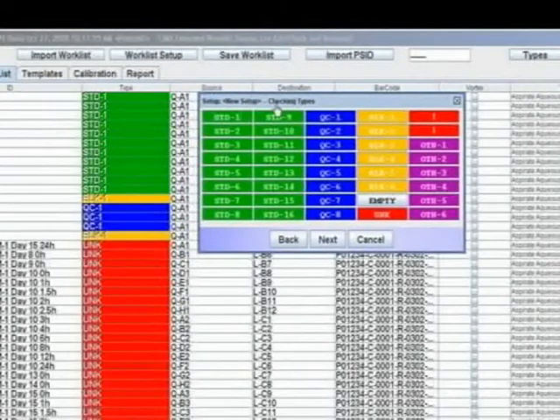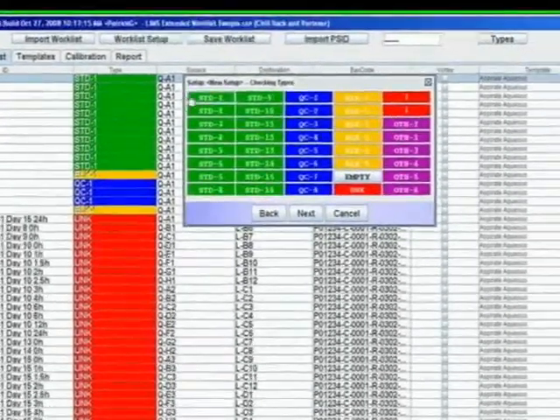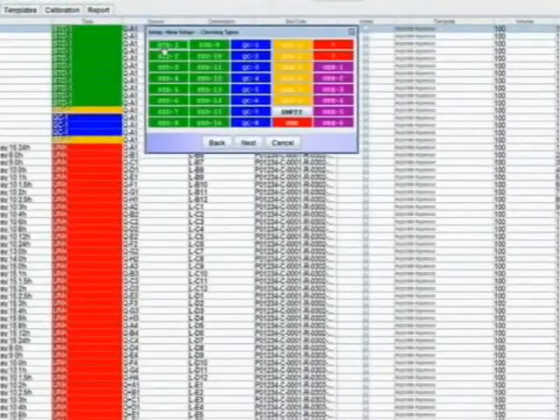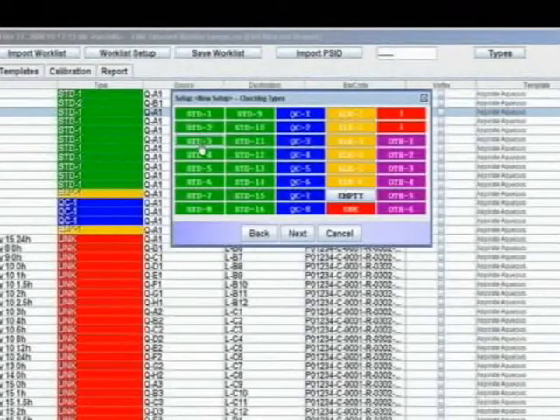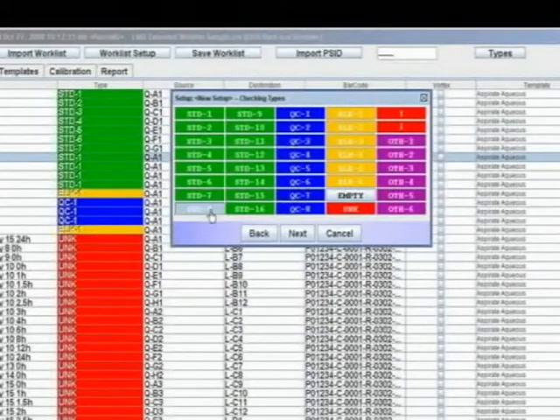In this example, click the first line as Standard 1. This type agrees with the ID. The highlighted line indexes. Clicking Standard 2 assigns Standard 2 to the second line. This proceeds through Standard 11, assigning a specific type to agree with the ID.